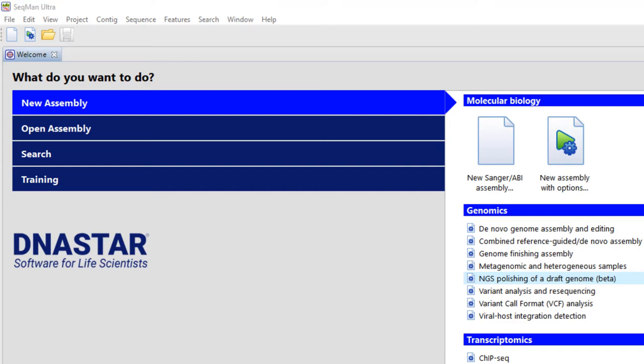In this video, I'll show you how to make a templated Sanger Sequence Assembly using SeqMan Ultra.